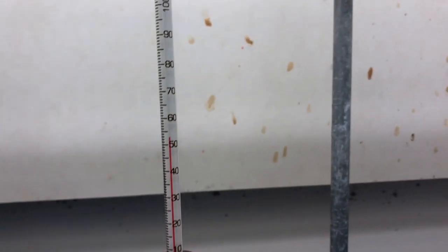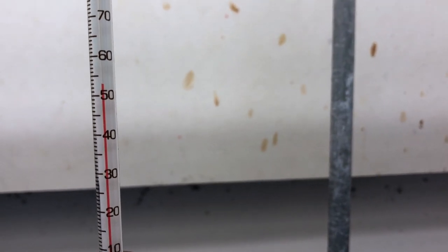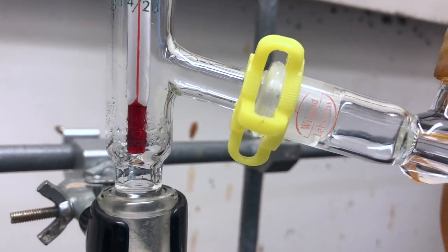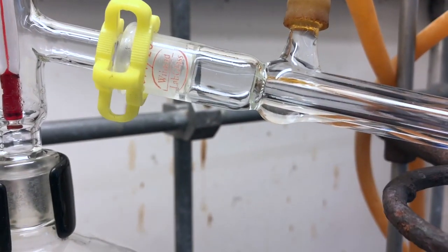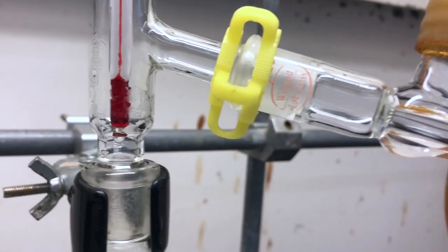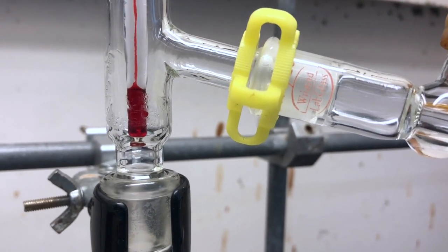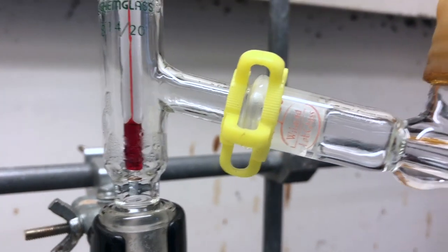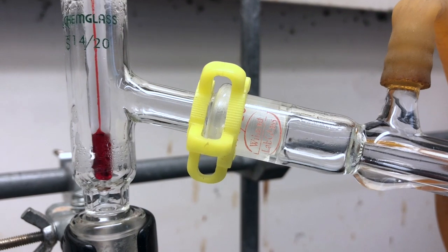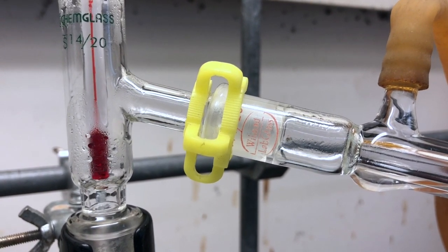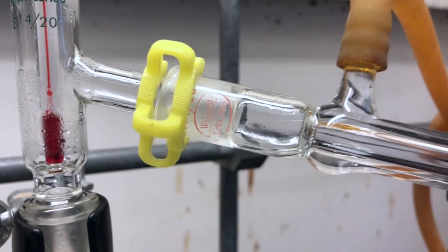You should see droplets of liquid starting to form on the sidearm. You can see the temperature is rising quickly at this point. Inside the distillation head is starting to look a little wet. Now you can start to see condensation happening heading towards the condenser. Liquid will start to build up right at the joint between the two pieces and eventually the liquid will fall back down into the condenser and run into our graduated cylinder.